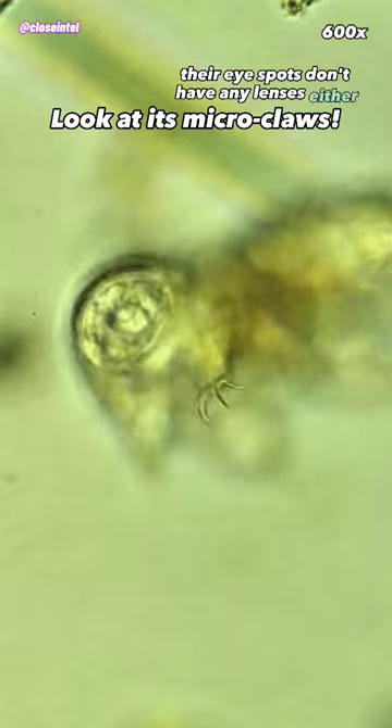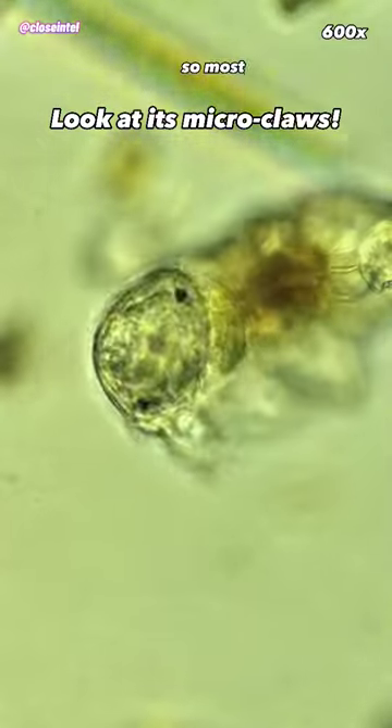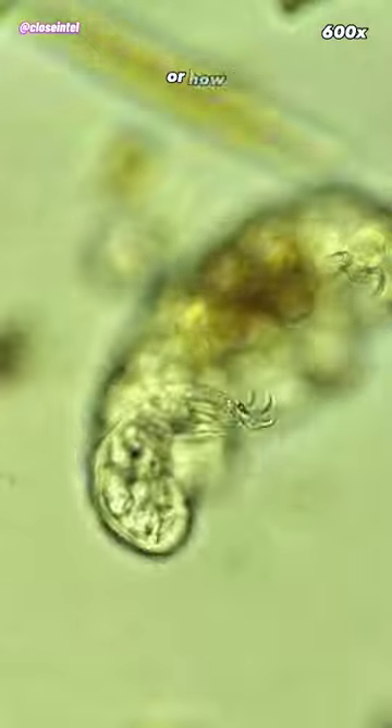Their eye spots don't have any lenses either, which also suggests that they can't form images, so most can only tell when it's darker or lighter out, or how intense the light is.